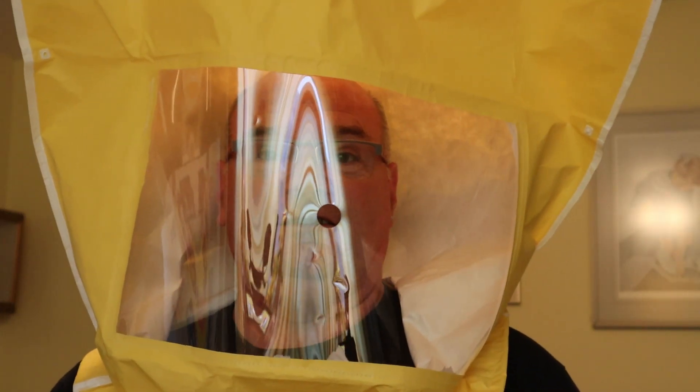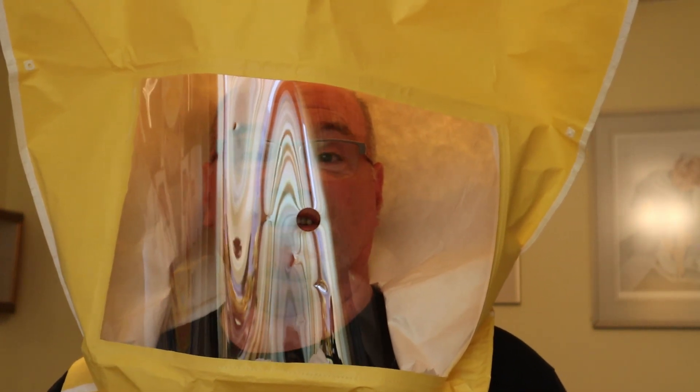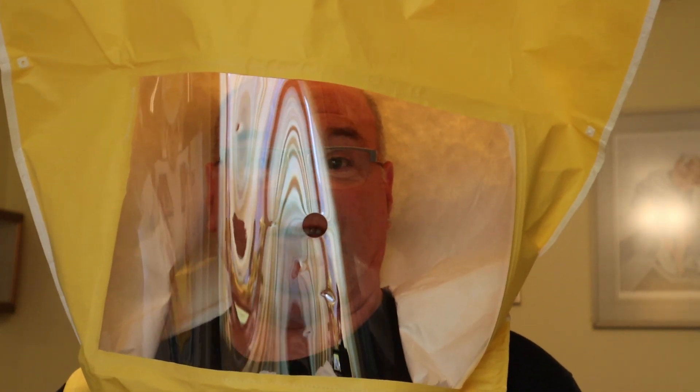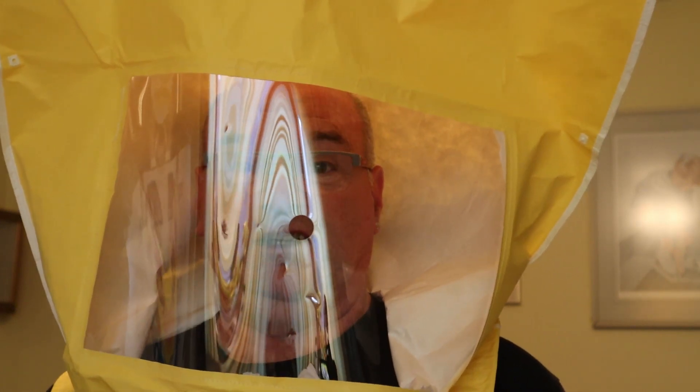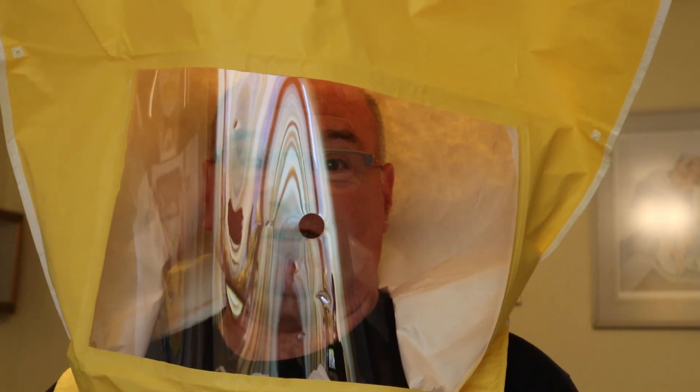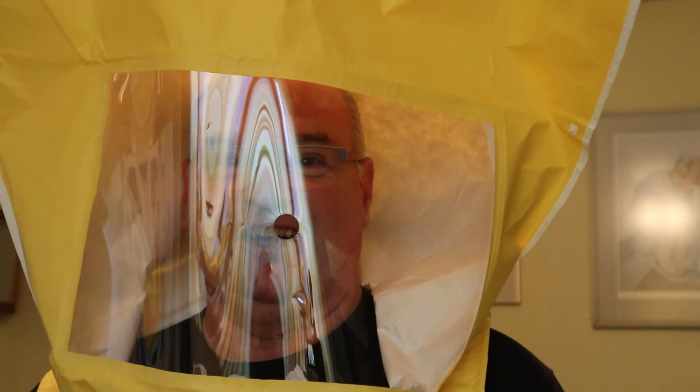Hi, I'm not an alien. This is a mask for doing fit tests for KN95 respirators as well as N95 respirators. I've been asked to do a fit test on some KN95 respirators purchased by a company in the area. I'm going to do the fit test and see how it works out. Hopefully it'll pass, but at the very least stick around because this is going to be fun — you'll get some enjoyment out of this.